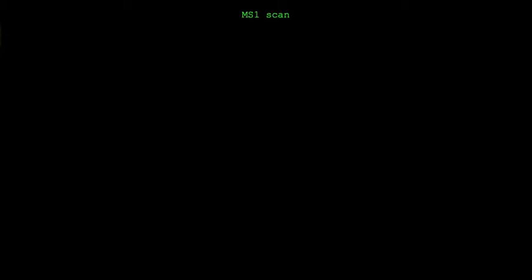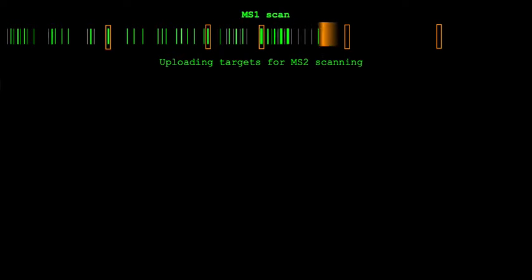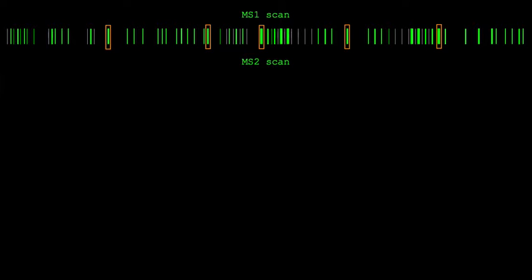Where does molecular identity fit within the COMPAS analytical workflow? One answer is that it can direct molecular identity discovery efforts. COMPAS is designed to yield a list of MS1 precursor ions with strong connection to biology, and whose MS1 coordinates, meaning M over Z and chromatographic retention time, are known. This list can be supplied to the mass spec instrument for targeted identification, revealing their identity.